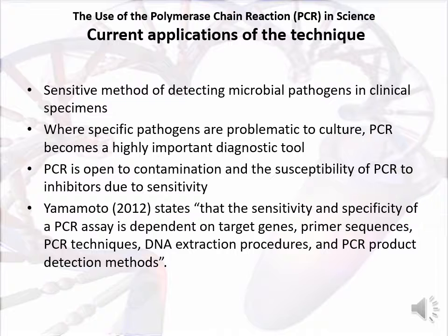As Yamamoto states, the sensitivity and specificity of a PCR assay is dependent on target genes, primer sequences, PCR techniques, DNA extraction procedures, and PCR product detection methods.